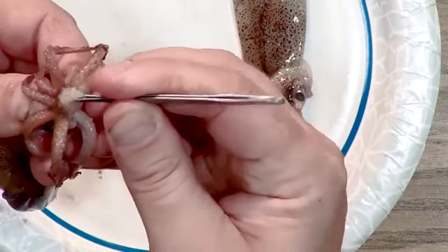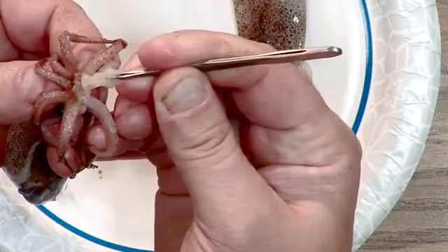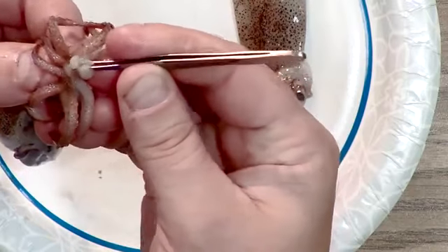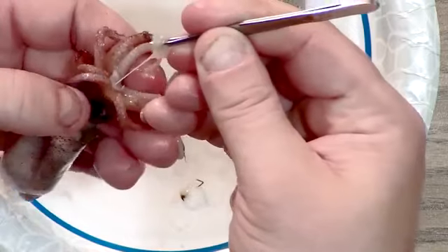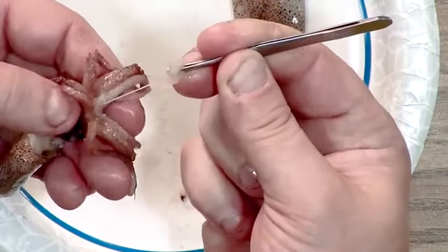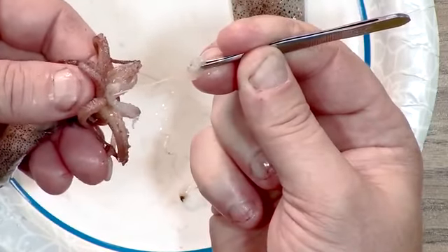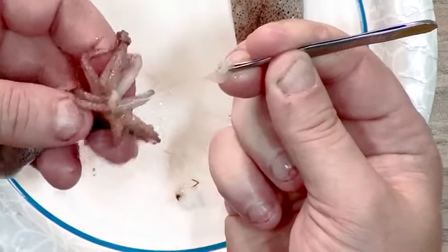Now it's coming apart here, but oh, we got it. All right. And as I pull this out, this piece right here is the brain of the squid. So see this white spot that's coming out? This is the brain, and there's a string attached to it. Well, just like us, our brain is attached to nerves, and this is the nerve.